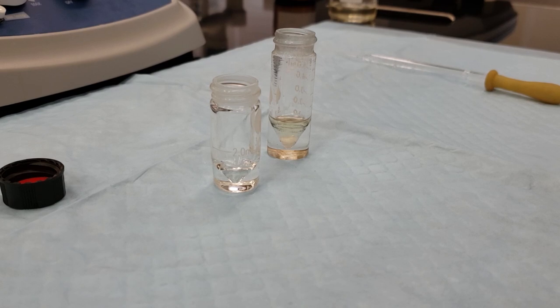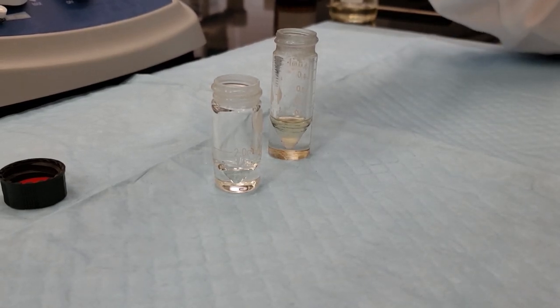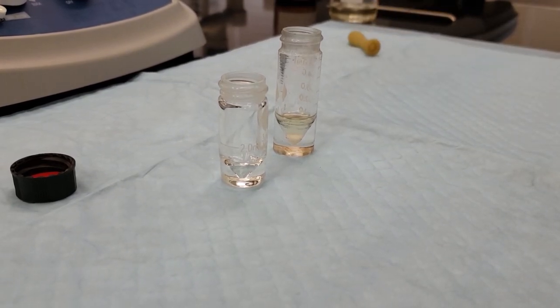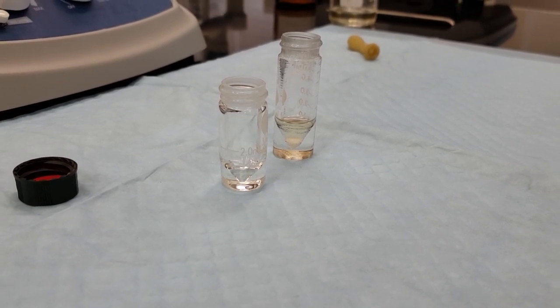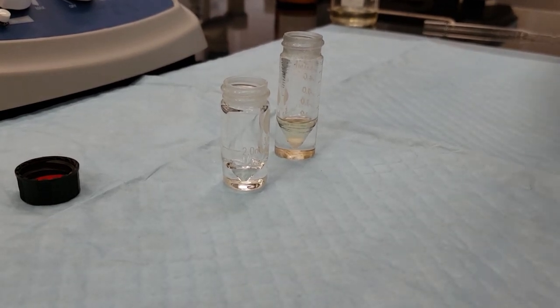We don't want to accidentally get any of our sodium bicarbonate drawn up into our layer, and then accidentally inject that into the GC. That can cause a lot of problems with our columns. So we'll get as much as we can while remaining safe. I'm going to use a new pipette, which I've got right here. And we're ready to go.